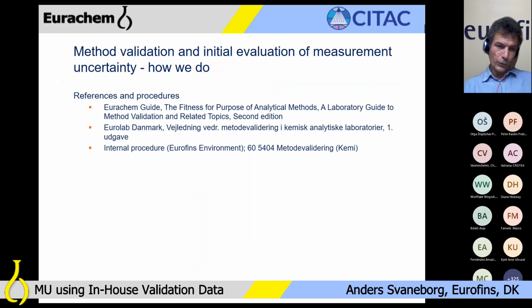The references we use for the initial method validation and evaluation of measurement uncertainty are the Eurachem guide, the fitness for purpose of analytical methods. Then we have a Danish guide made within the Eurolab. This is actually based very much on the Eurachem guide. And then we have in our company an internal procedure on how to make a method validation.